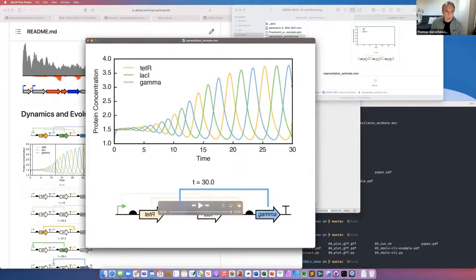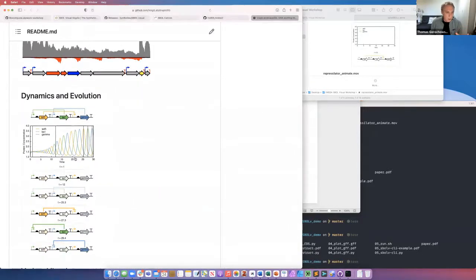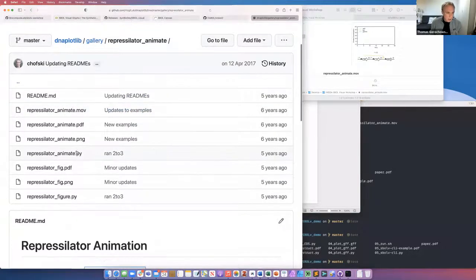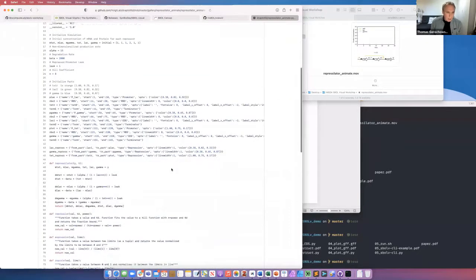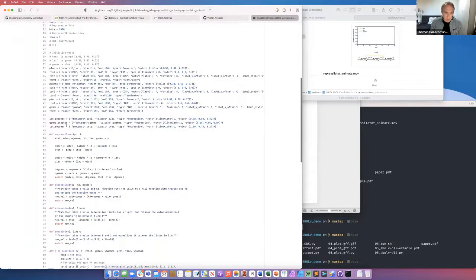And this is really valuable. And just to show that these sorts of things are not crazy to code, if any of you are thinking, oh, that looks really complicated to do, the code to create this thing, if I make this a bit smaller, isn't crazy. There's some elements at the top which are basically defining what the parts are in the design.